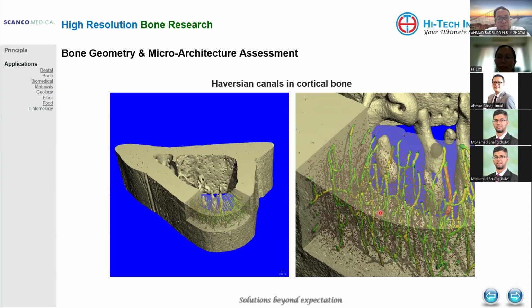So you mentioned software, how it's not only about the MicroCT itself, but also the software to manipulate the images. Does the software come together with the MicroCT hardware, or do we have to find our own software? I'm not sure about other brands, but for Scanco, they spend a lot of time creating their own software, their own scripts. So it definitely comes together as one package.